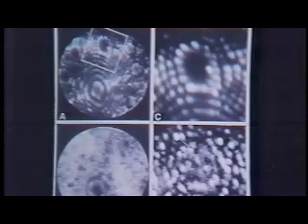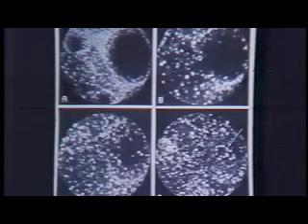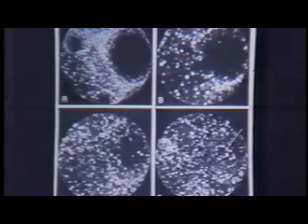CO goes everywhere onto the surface, comes off at a much lower field strength, and images the surface entirely. If you then created a metal surface with large thermal facets, you would see in a field ion microscope image something that looked like this. Large dark areas. This crystal plane, the 110 plane, is about 3,000 angstroms across. You see no detail in the center of it. You only see detail where these thermal facets join together.